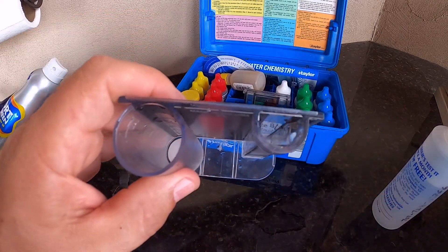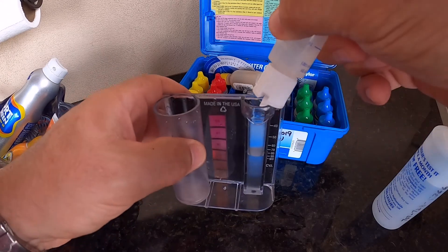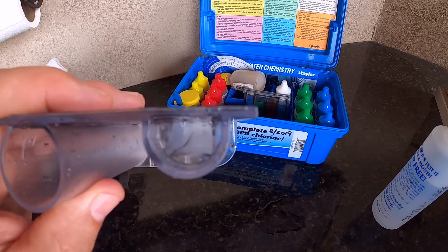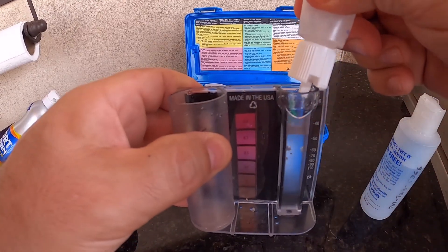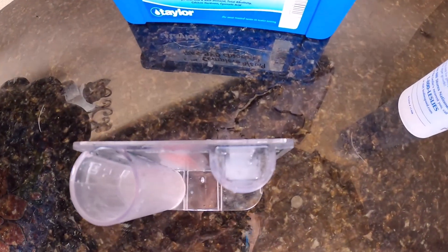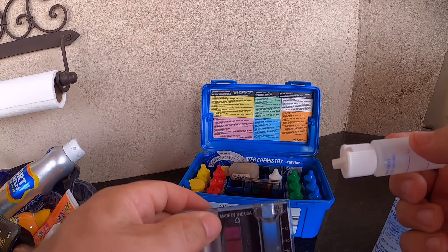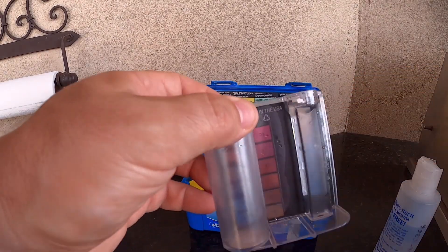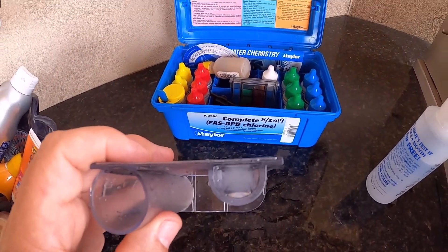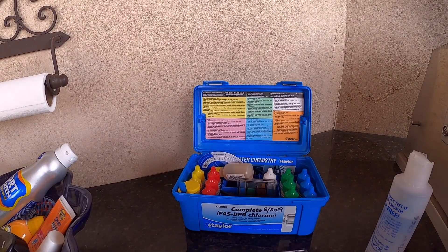I filled it up to about the 70 line and you can still see the dot. Here's about the 50 line — a little bit more. I'm in between the 30 and the 40 line, just barely see it. This is pretty much the minimum reading it'll go, and we're just barely washing out at about 30. So the CYA currently for this pool is about 30.